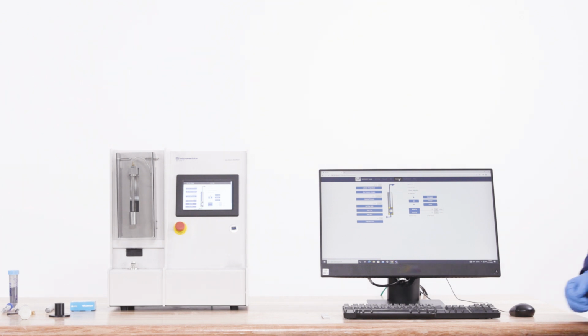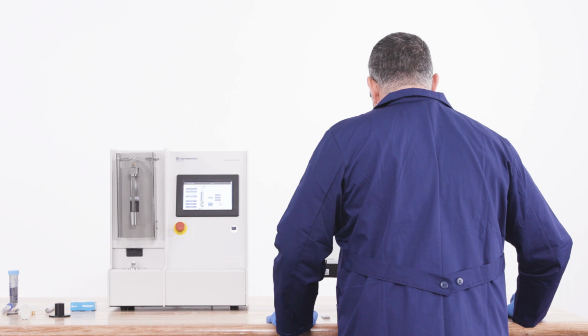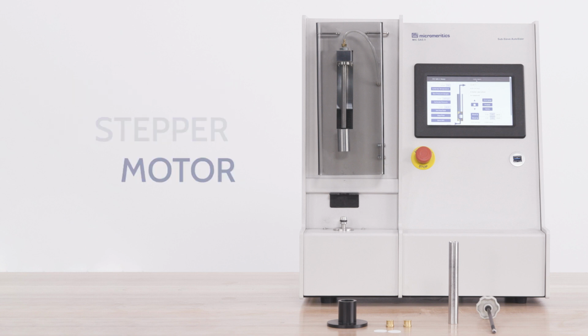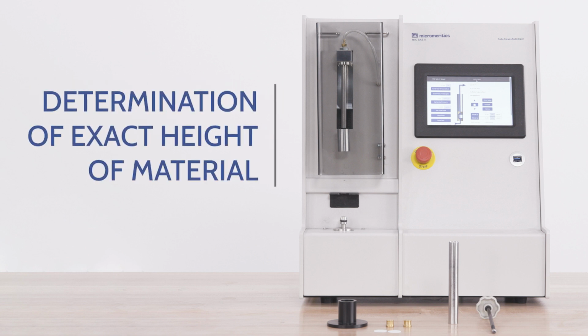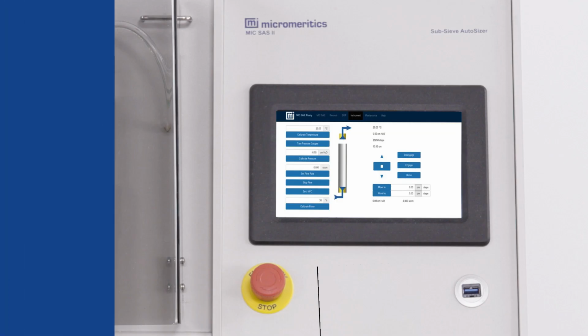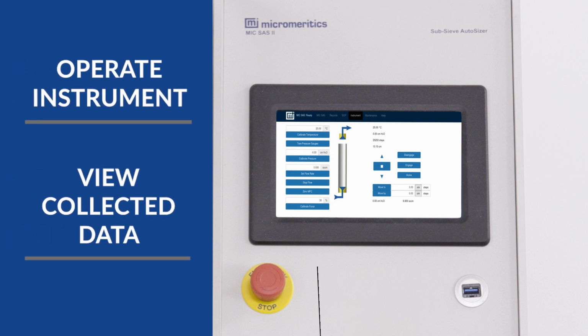First, we are going to take a look at the instrument and familiarize ourselves with the modern components. The piston is controlled by a stepper motor that is zeroed prior to an analysis. This lets the instrument determine the exact height of the sample material during compression in order to calculate the powder bed porosity. The touchscreen is an internal computer used to operate the instrument and view collected data. You can navigate using a stylus or your finger.